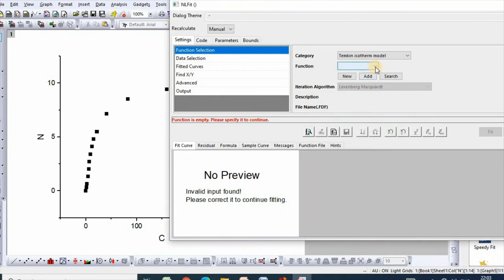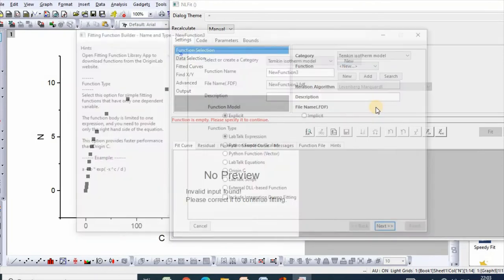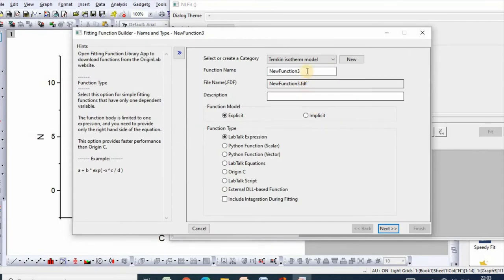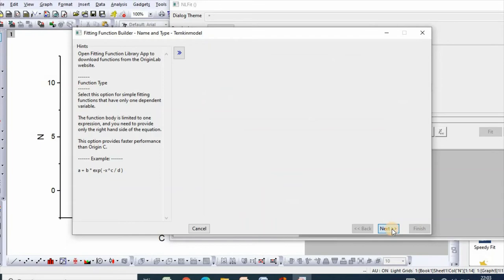You can also rename function as Temkin model. After this, click Next.